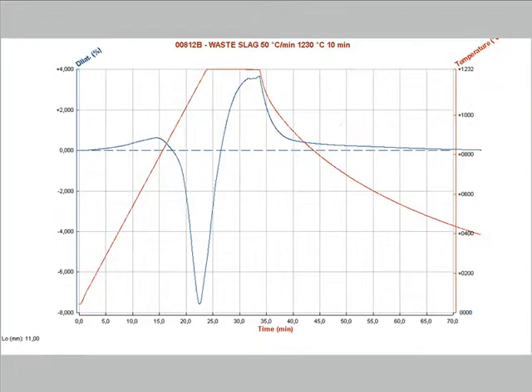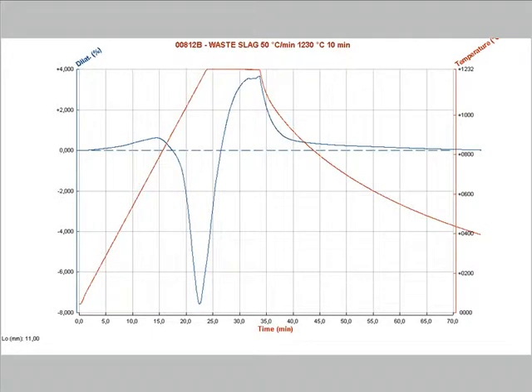This last example is an industrial waste slag which shows bloating behavior. This material is used for the manufacturing of lightweight aggregates. The analysis of this sintering test clearly suggests the temperature and the time needed to obtain the maximum bloating before the material starts collapsing.